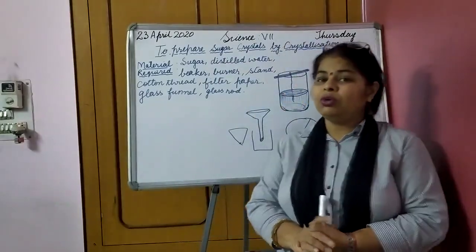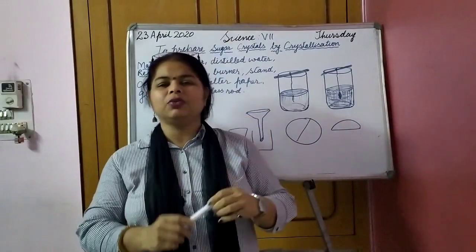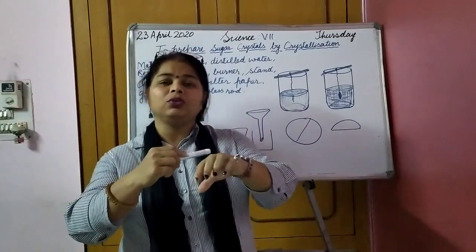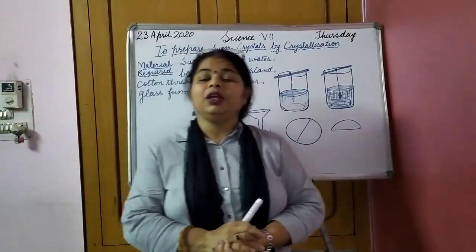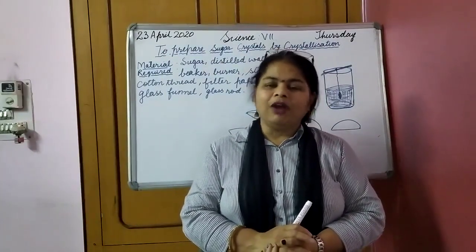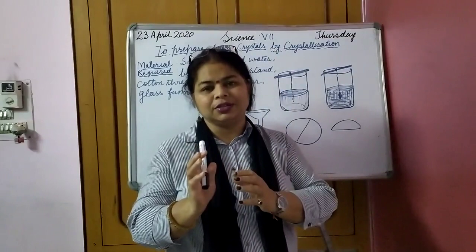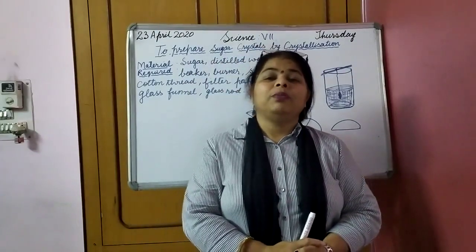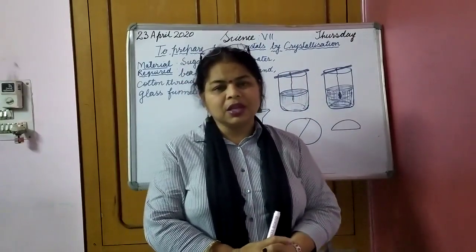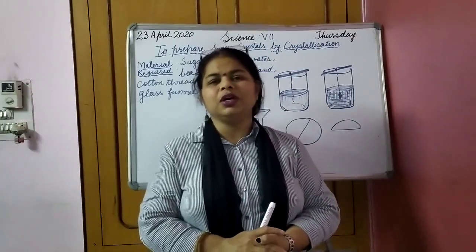After that, we place a stand and tie a thread on it and suspend it in such a way that the end of the thread is dipped into the solution. Okay, and leave it undisturbed for 2 hours, and let it cool. After 2 hours, we observe that some crystals start depositing on the thread. So this is how, practically, we can prove that crystallization takes place. And this we can do with salt also. It's not that only sugar is required, we can do it with salt also.